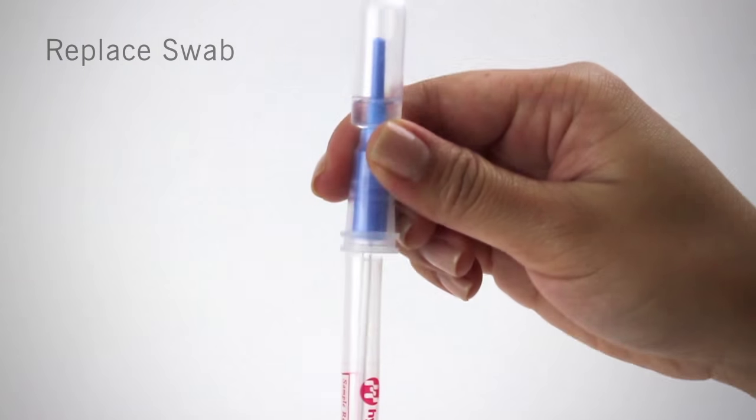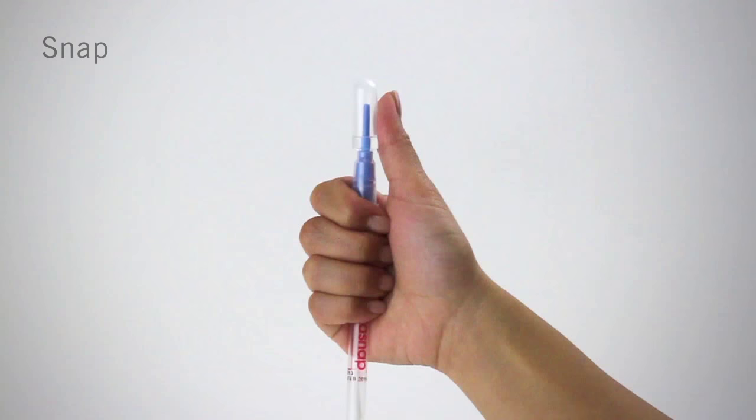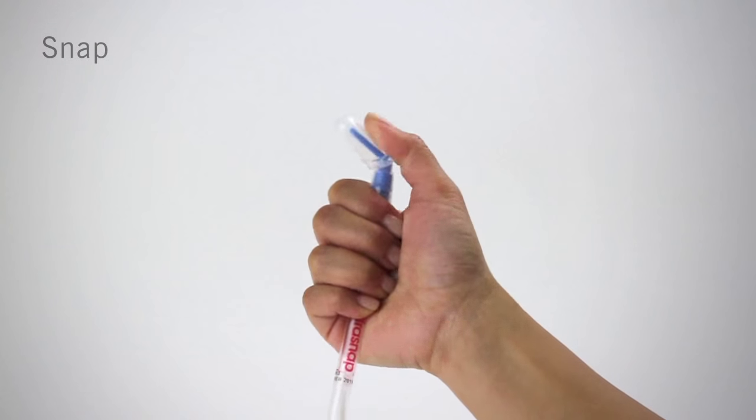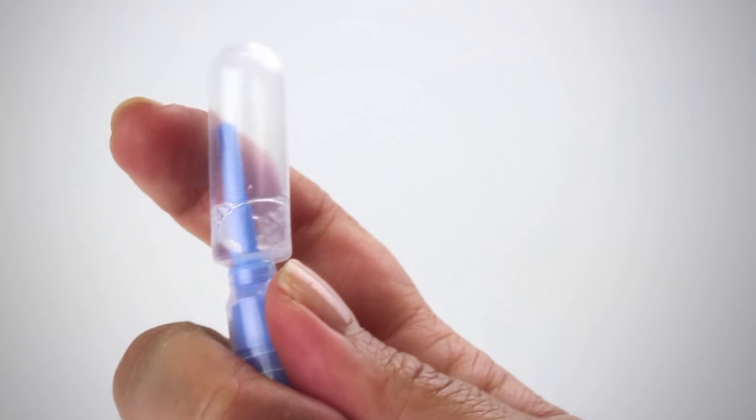Replace the swab in the tube. The easiest way to activate UltraSnap is to hold the device in your fist and use the thumb and forefinger to break the snap valve by bending the bulb forward and backward.